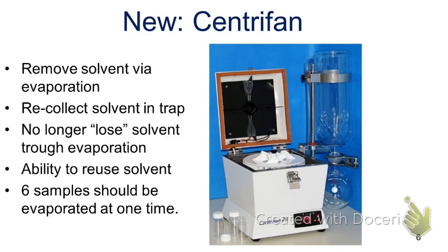You could potentially see your solute evaporating, but in most cases you won't see that. It will stay as a solid. It might turn into a liquid, but the odds of it going from the solid to the liquid to the gas and actually losing it are pretty slim. You breathe it in. You've now exposed yourself to organic solvents. Okay? You've turned those into a vapor. Those are now in the gas state. You can potentially breathe that in. That is a possible hazard. Okay? So what we want to do is prevent that from occurring. That's what the Centrifan will do. So it's going to speed the evaporation process.